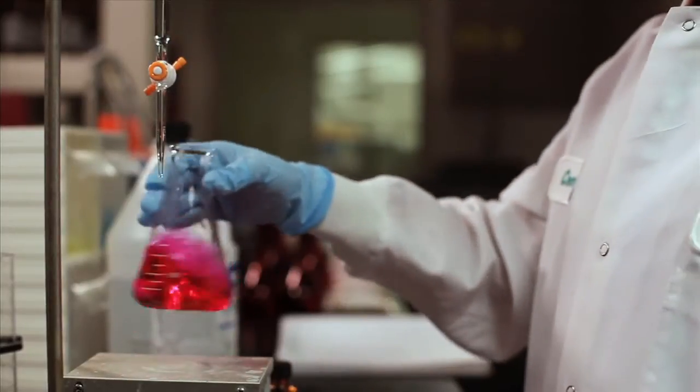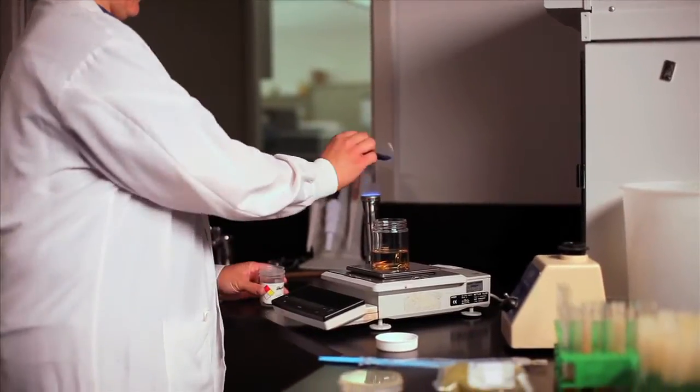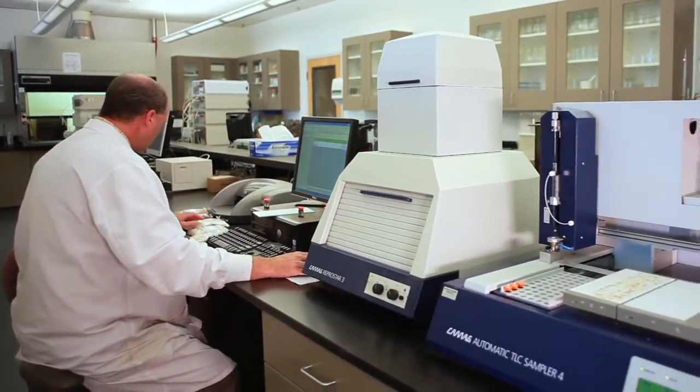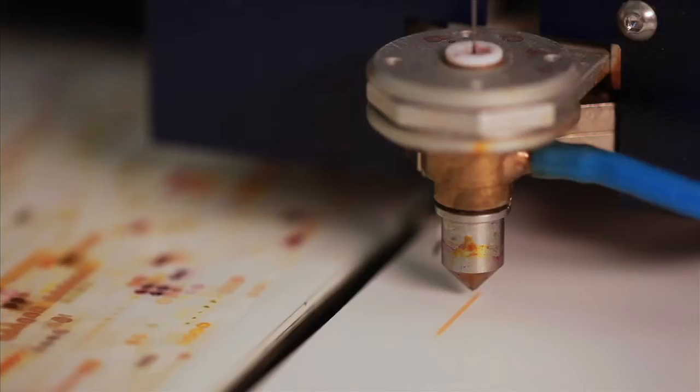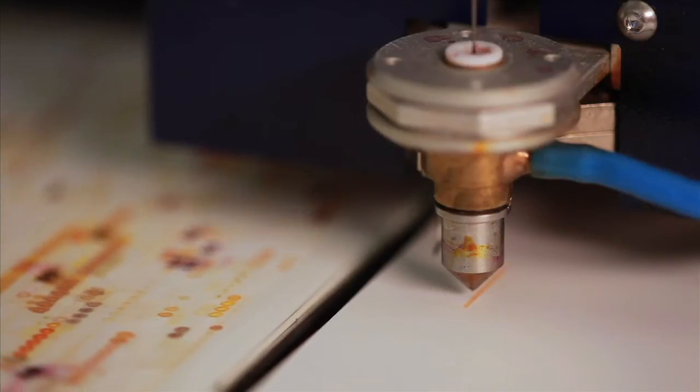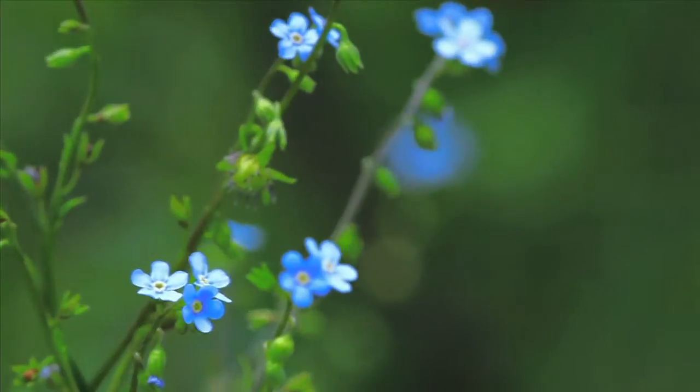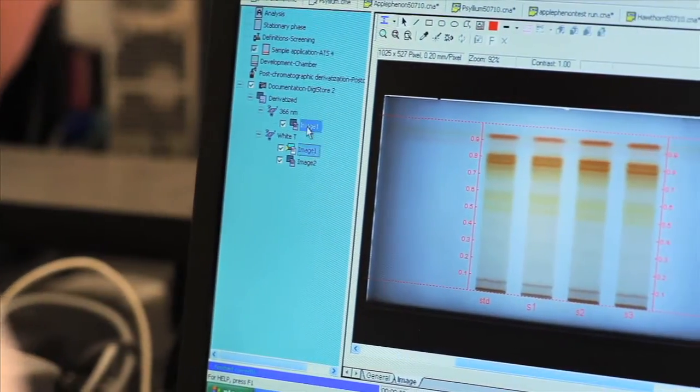We run over 600 tests. Let's look at tests that are commonly done in each one of our four labs. One of our more unique and important tests is TLC, Thin Layer Chromatography. Since our ingredients come in powder form, this test helps us identify that it's not only the right herb, but also the right part of the plant. It also checks for any fillers or adulterants, as only the most pure ingredients are accepted for our products.